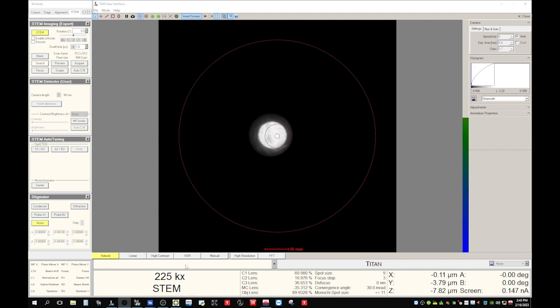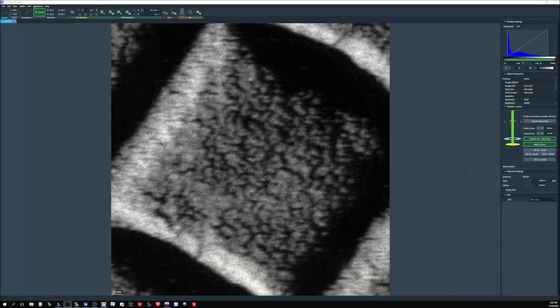Before we start the alignment, let's do one more thing. Go back to the acquisition in VLOX and come to the detector settings. You see the gain offset — set the offset to 43%, then set the gain offset to 45%, and set the gain to about 37%. The purpose is to make sure the corrector software gets enough counts. With these numbers, the count is about 10,000 counts, which is just okay for the alignment.